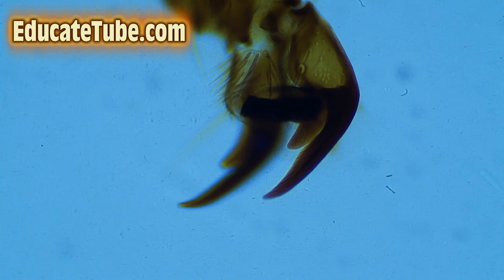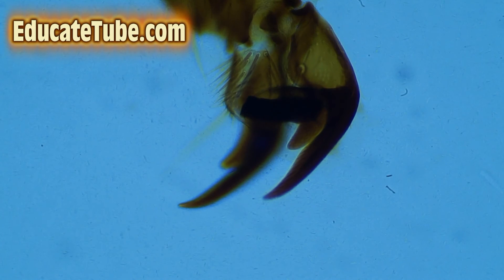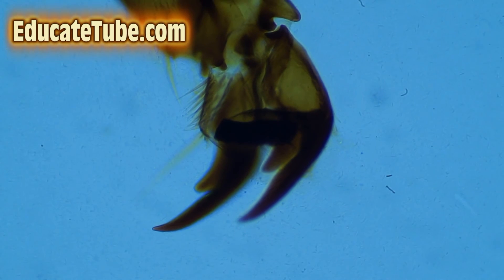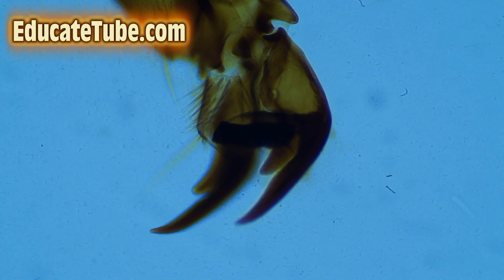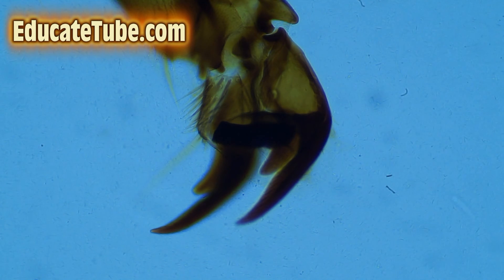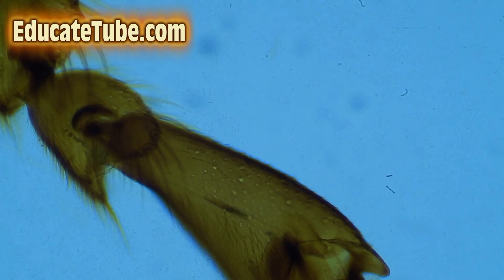The hair-like structure is actually found all over the Honey Bee's body and legs. This is how it's able to spread pollen to the stigma of the flowering plant, thus fertilizing the plant. That hair-like structure is very important. God's creatures are just amazing — if you look at the fine detail under a microscope, you can see so much function.